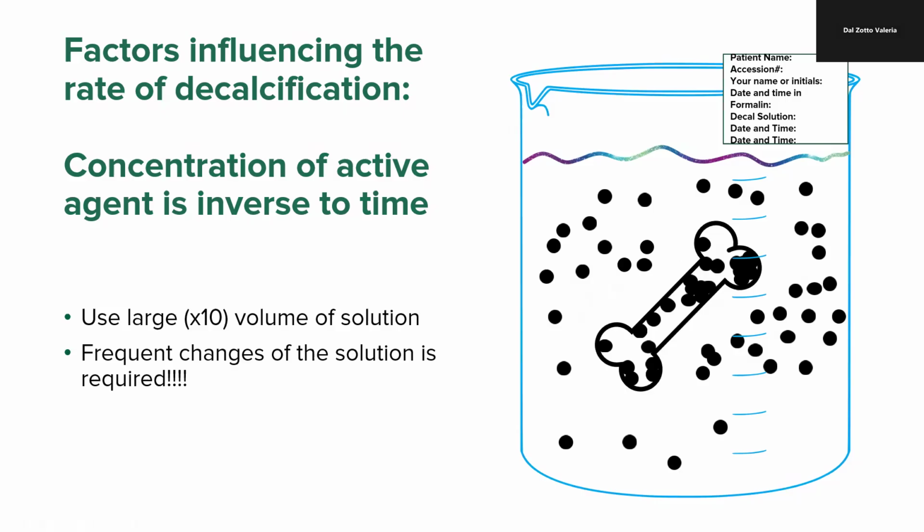So we need to extract the piece of bone, discard the solution, and put a fresh solution again to have the same results, or further results.